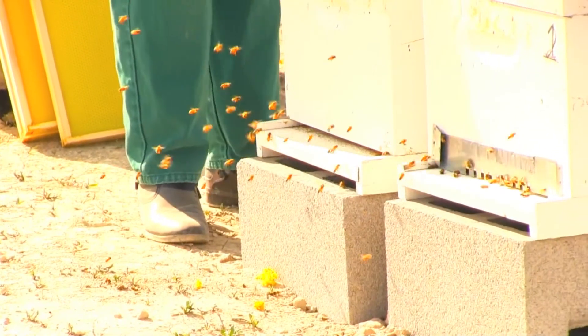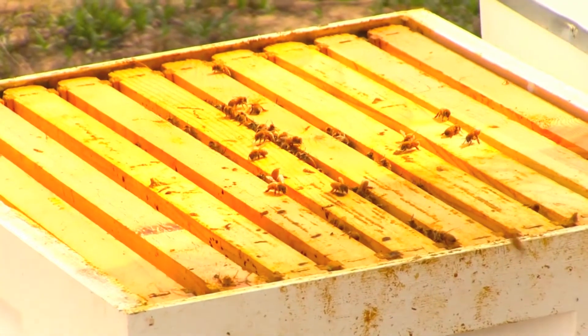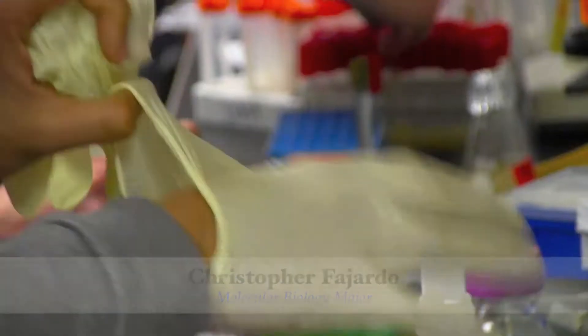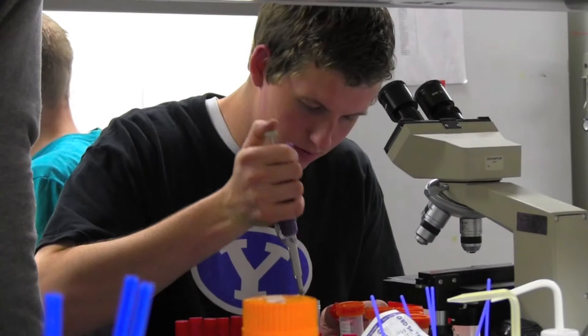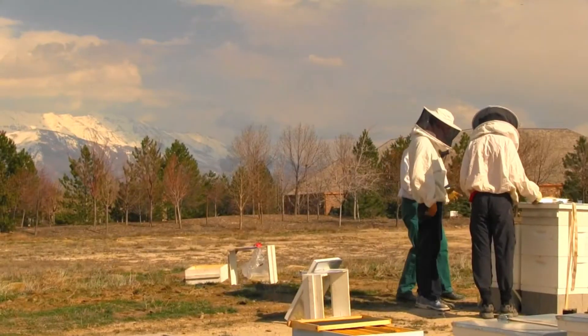At some point we're hoping to do treatment studies with the bees, so there will be a fusion between the work we do in the lab and the research we do with the bees. I really like working in the lab, being able to do hands-on work — to go from the field into the lab, do genetic work, and actually see results from what I do throughout the semester.